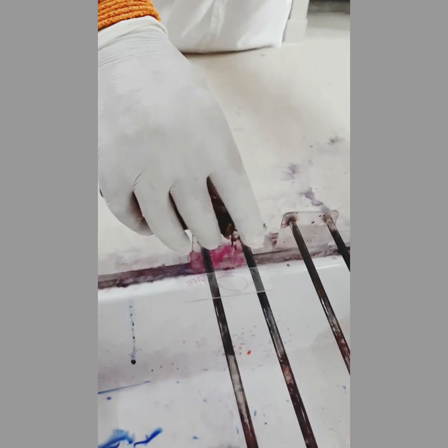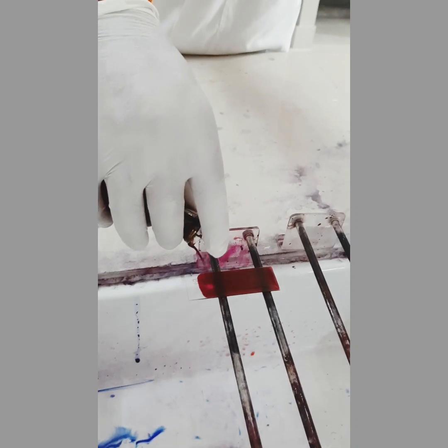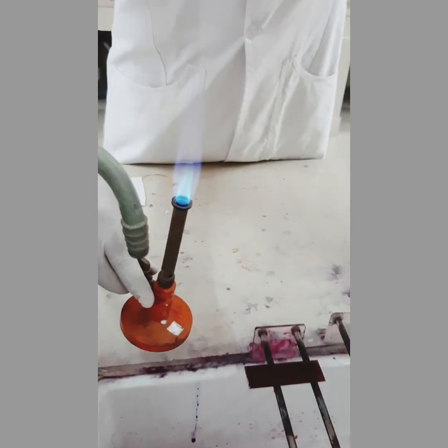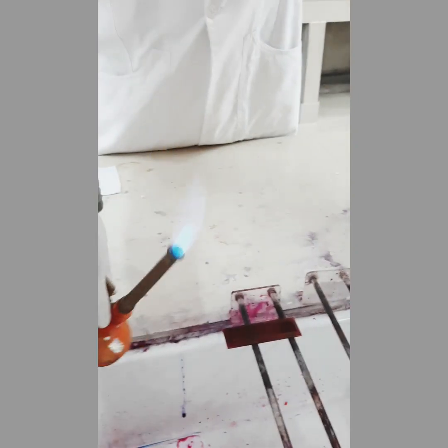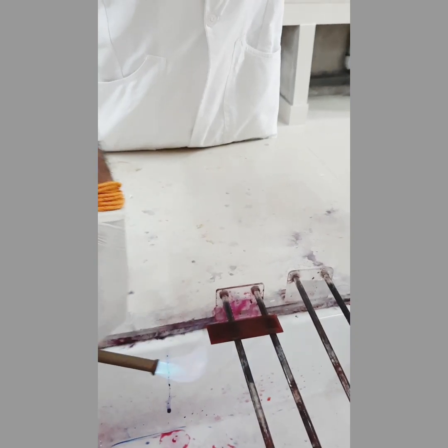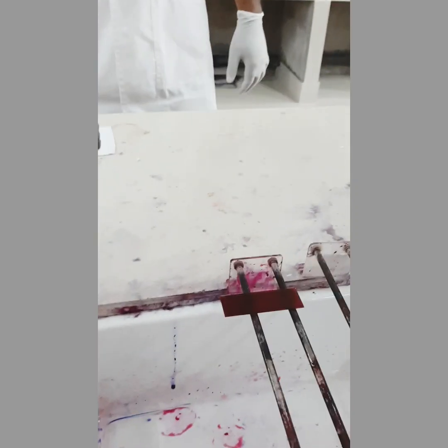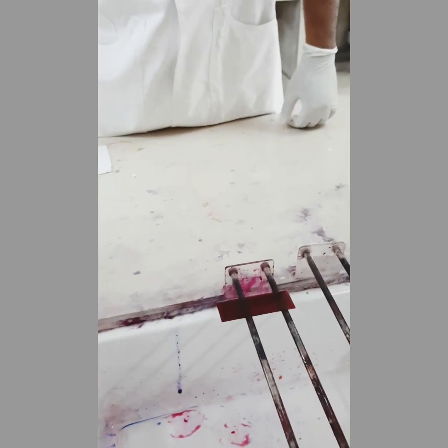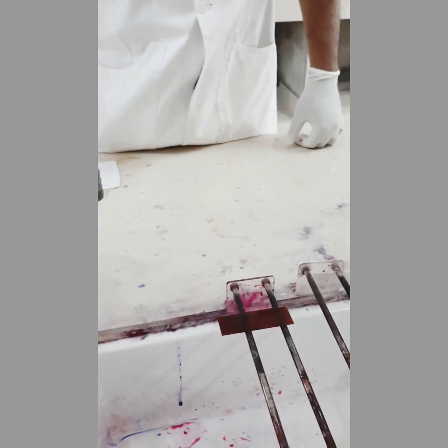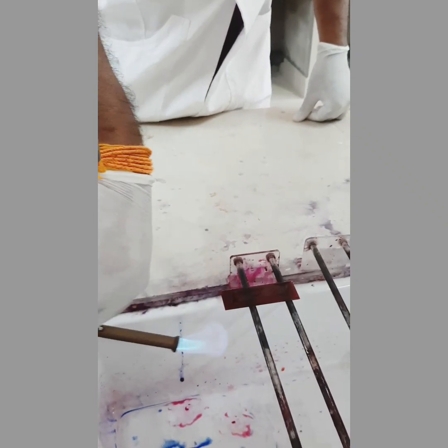Keep the smear on the rack. First step, we are pouring carbolfuchsin, that is Ziehl-Neelsen carbolfuchsin. You have to cover the entire slide with the stain solution. Keep it for 5 minutes with intermittent heating, that means do not allow the stain to boil or dry. That is a concentrated carbolfuchsin.